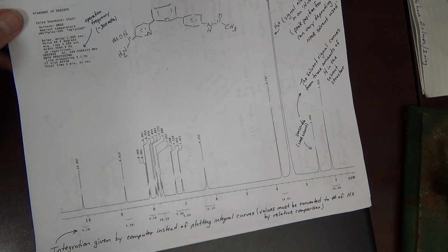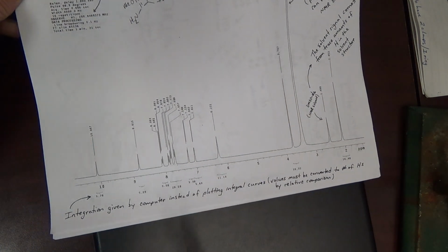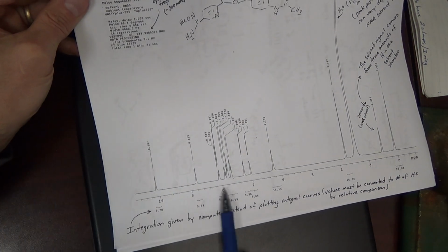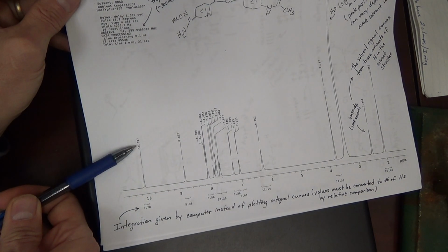first off, this is a real life NMR. Okay, it was obtained here using our NMR at AU. We can sort of look at it for a moment. Baseline, the exact peak positions are given above the signal. So we see this is approximately just above 10, but the exact peak position is 10.09.